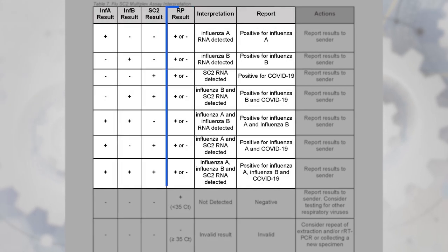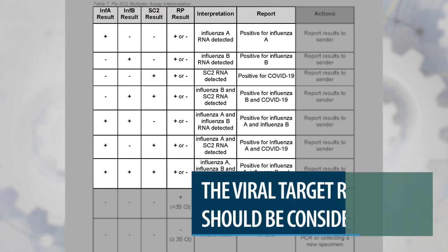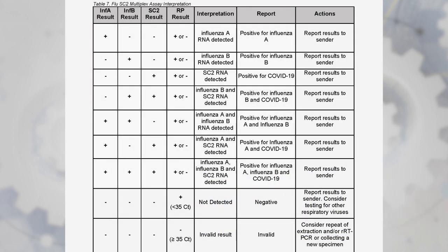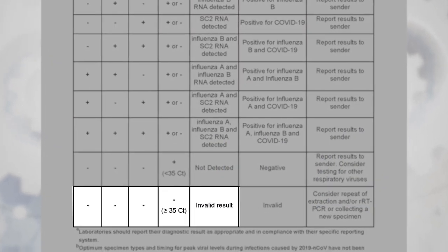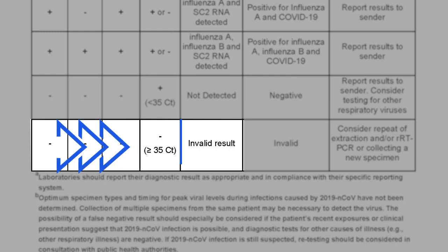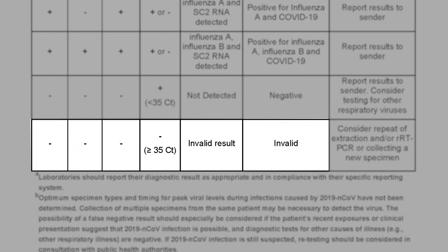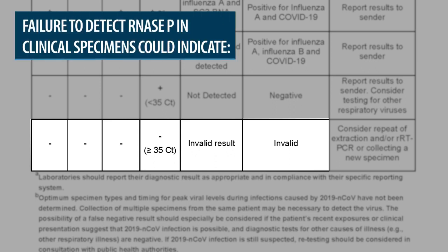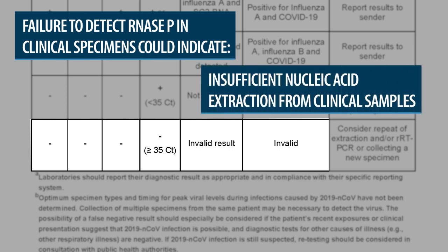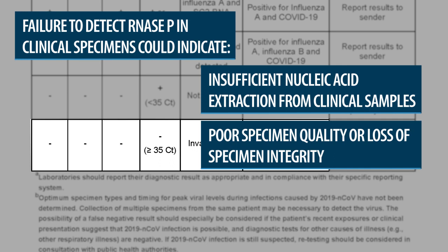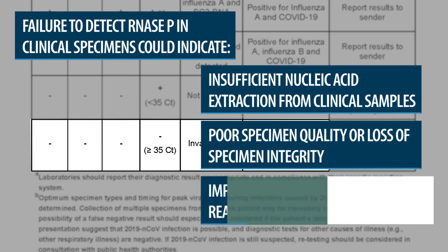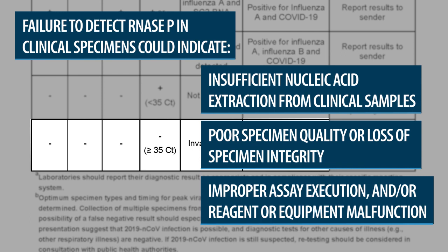If RNAs P is negative in the presence of a positive result for one of the viral targets, the viral target result should be considered valid. However, if all viral targets generate negative results and RNAs P is also negative, the test is considered invalid. Failure to detect RNAs P in clinical specimens could indicate insufficient nucleic acid extraction, poor specimen quality or loss of specimen integrity, improper assay execution, and/or reagent or equipment malfunction.